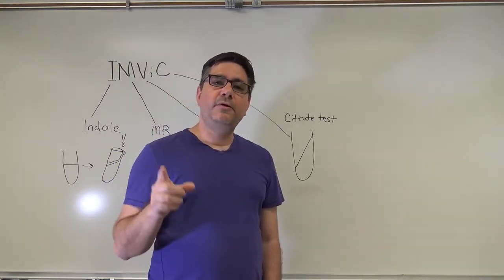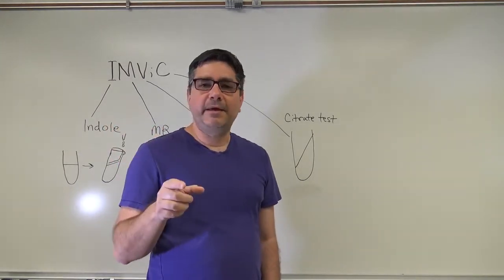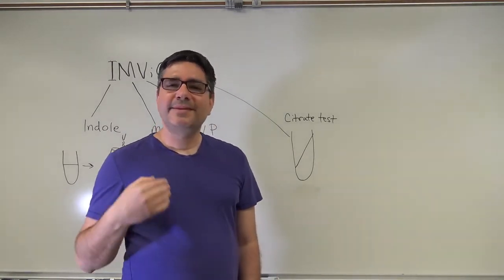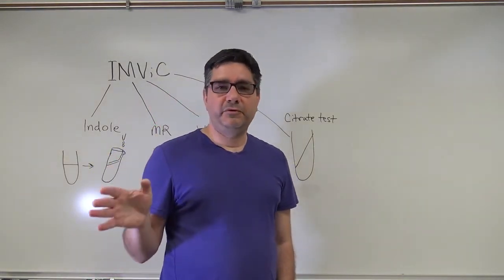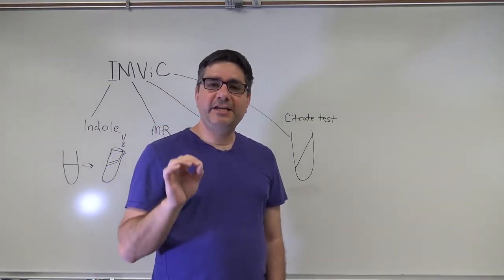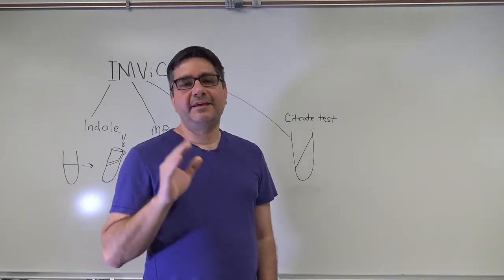By doing so, the organism creates an alkaline or basic environment in the medium, which is detected by the pH indicator bromothymol blue. At an alkaline pH, the medium turns a beautiful blue color. Those organisms that cannot use the citrate as a carbon source will not change the color of the initial medium, and the medium will stay green.